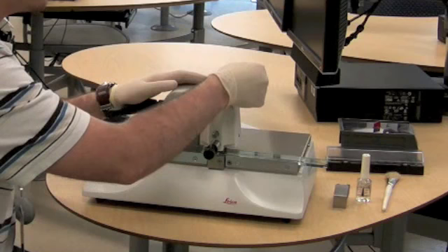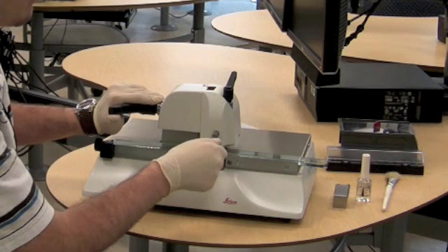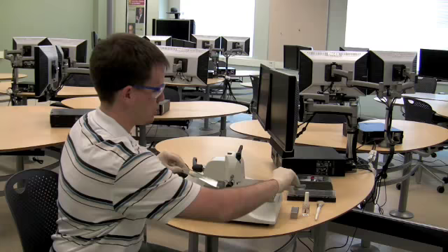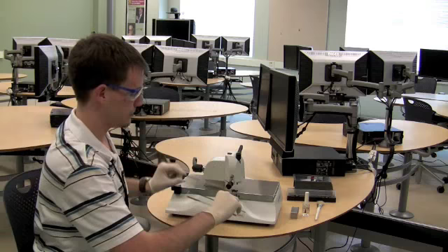So the next thing we're going to do is turn back the breaking lever, and we're going to lift the clamping head by holding under the scoring shaft and slowly bringing up the clamping lever. What we're left with are two 200 millimeter pieces of glass. The piece that was on the right is what we're going to continue to use to make the knives.